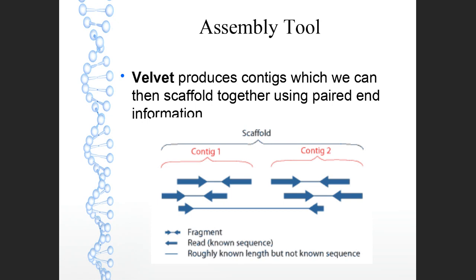So there are a few different parameters we can decide upon when making our assembly. We can decide upon the k-mer length, and we can put on various other filters. Throughout the practical, we're going to ask you to toy with these parameters a little, and then share the results onto a Google spreadsheet. This way we can see exactly how these different parameters affect our assembly. So don't feel constrained to using the exact parameters that are laid out in the practical.